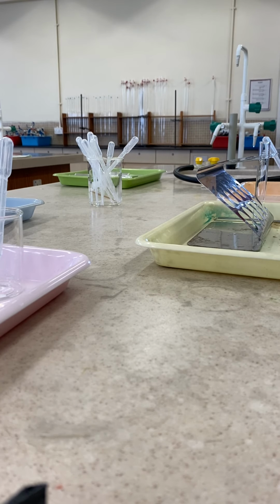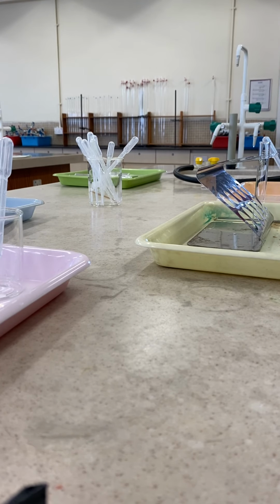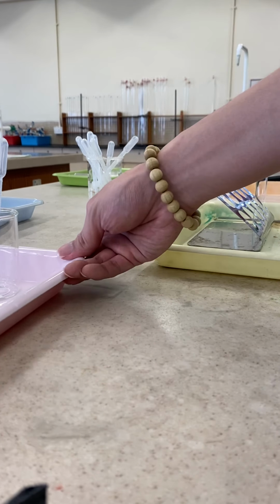In this experiment, I would like to show you two things. First of all is the reaction between copper-2 sulfate solution and ammonia. And then the second one is for the copper-2 carbonate, and I would like to add some acid into it to see what will happen.